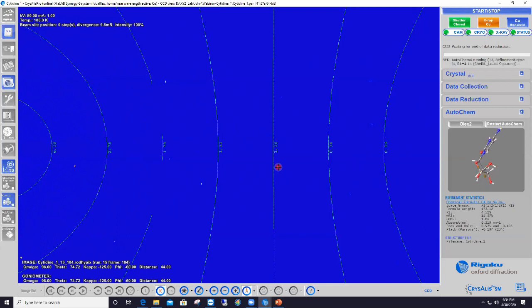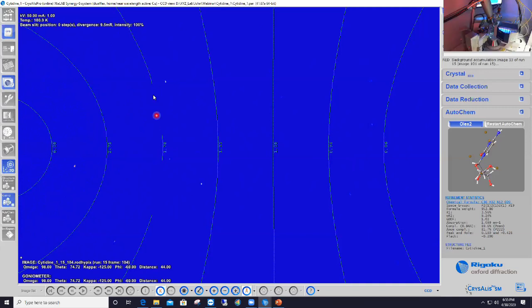So maybe, Pierre, if you change the contrast a bit. I'm afraid I'm at the maximum contrast already. Okay, so there are actually 3 panels there, Doug, and if you look carefully along about 1.78 angstroms, you can see there's maybe a little bit of a break there, and that's one gap. So here, actually, you see that the resolution ring at 1.78 angstrom is broken because there's a gap here, and the same, okay, you maybe can't see it, but I see it directly on my screen here. There's the second gap there where my red cursor is located right now.